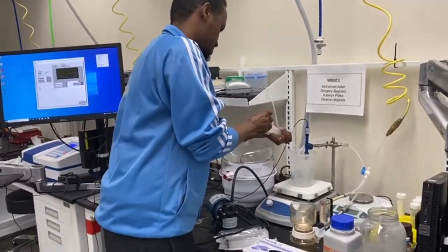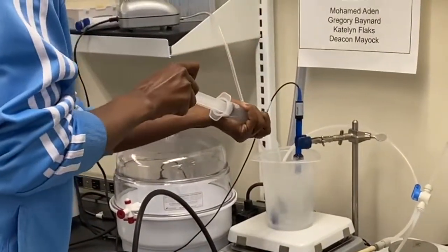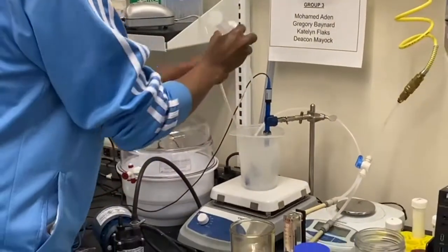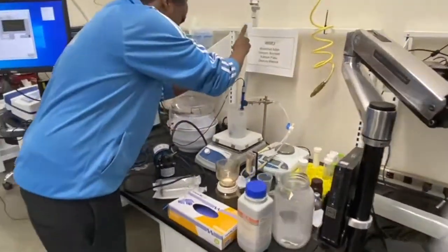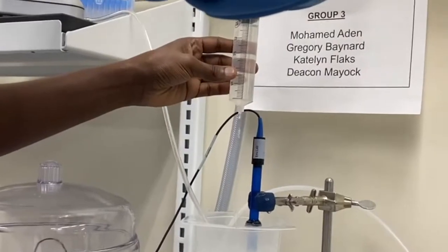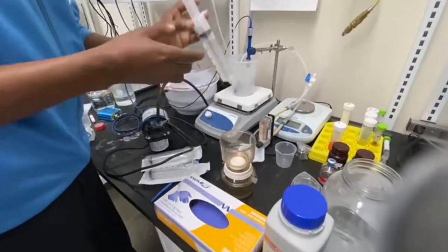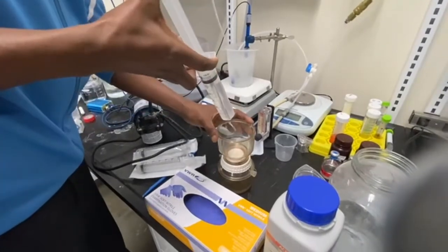We then placed 2 air stones in the reactor to constantly supply carbon dioxide from the air. The reactor was stirred continuously to ensure a well-mixed solution. Finally, we added our desired amount of calcium chloride to begin the experiment.